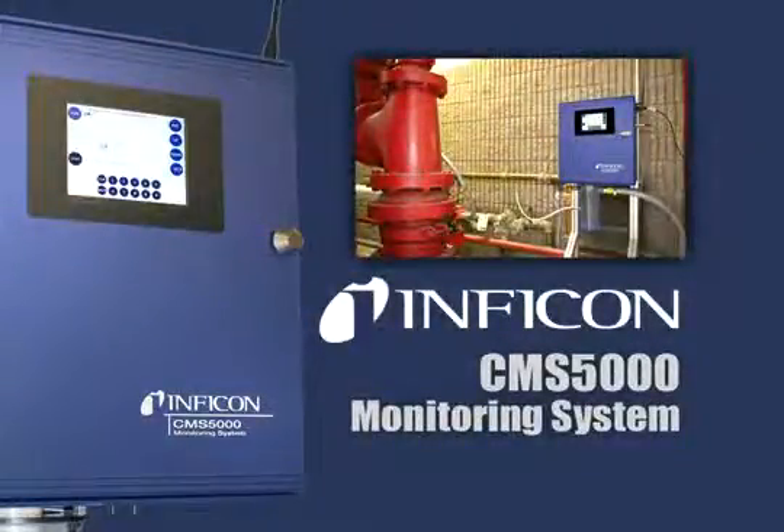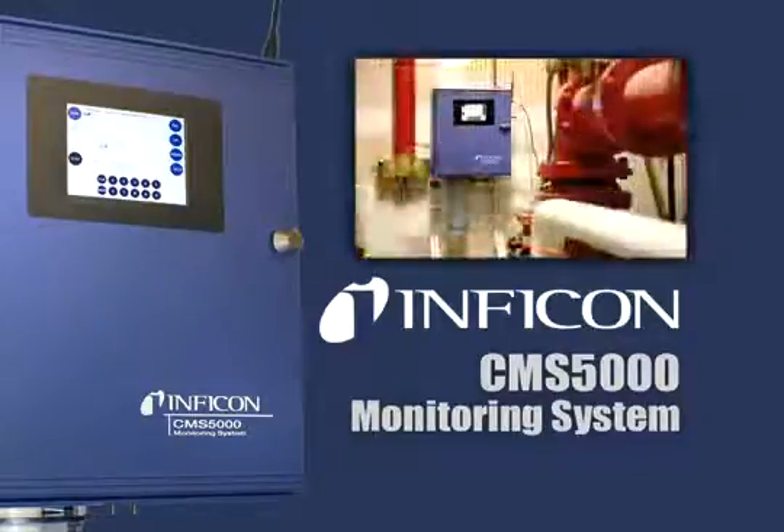The CMS5000 is an online water monitoring system that uses gas chromatograph technology for separation of analytes and a micro-argon ionization detector for the identification of volatile organic compounds, VOCs, in water.